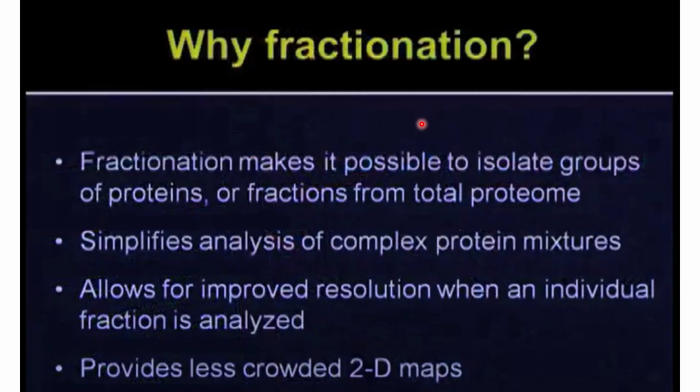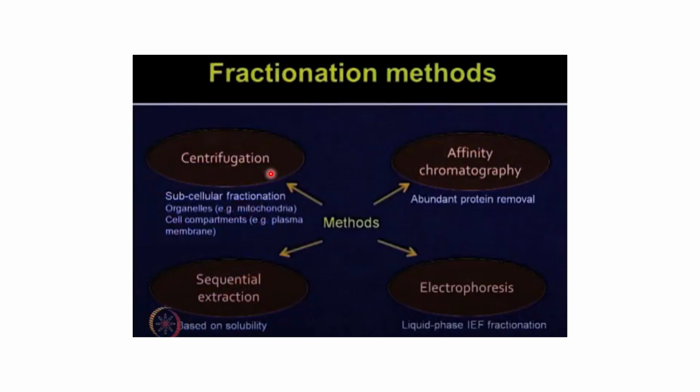Then why is fractionation required? Because it makes it possible to isolate groups of proteins. So it simplifies analysis of a complex protein mixture. So you need to separate them accordingly. It allows improved resolution when an individual fraction is analyzed, and it provides less crowded 2D maps basically.